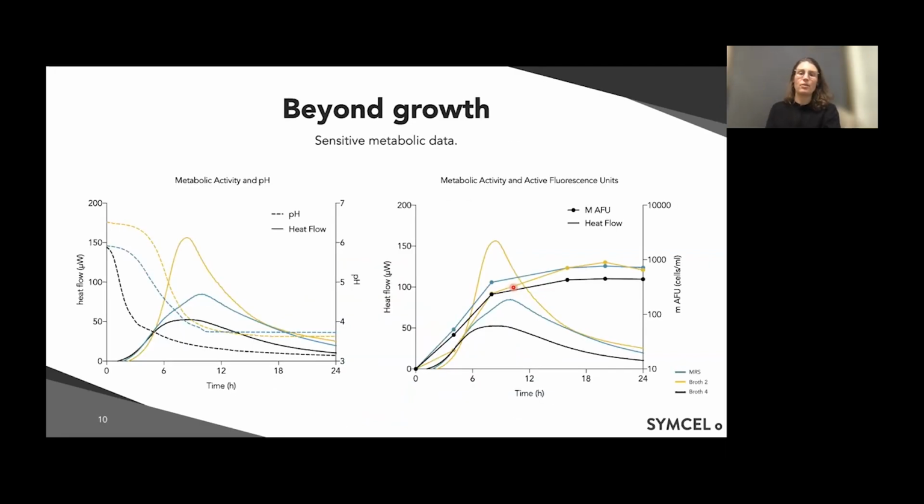And that is shown here on an example. So you imagine you have a probiotic strain and you want to upscale and produce it, but therefore you want to test where the strain is having the maximum viability and vitality. And then here on this example, we tested 3 different media, MRS, like a standard medium, and 2 home formulations. And the goal here was to check the maximum activity and performance of the strain.